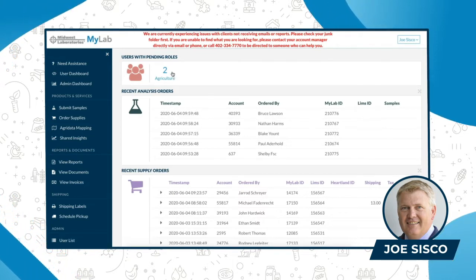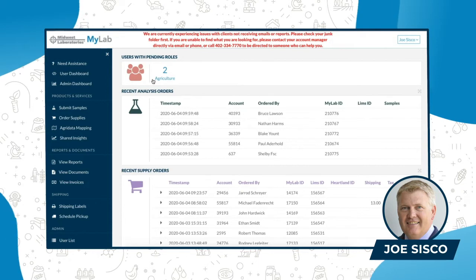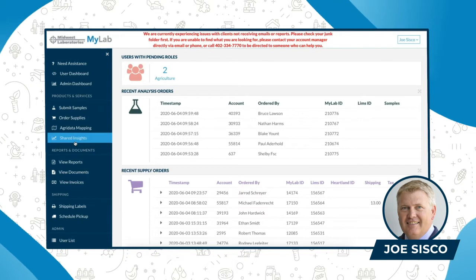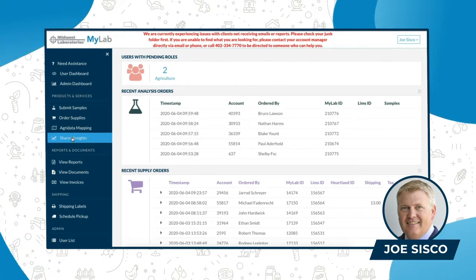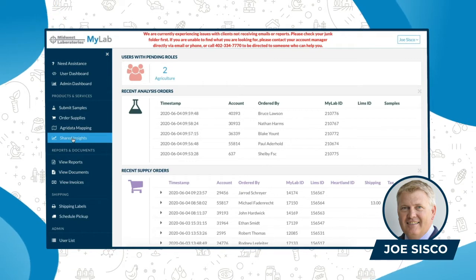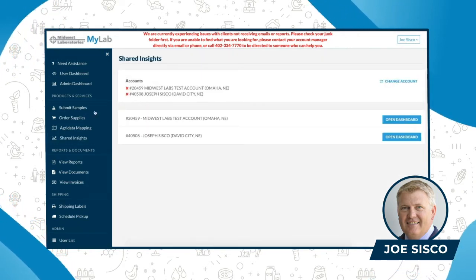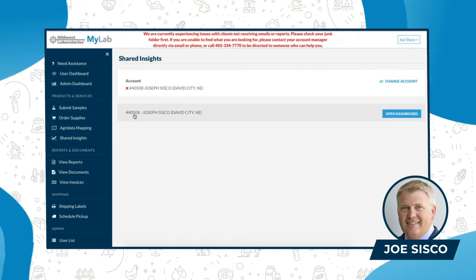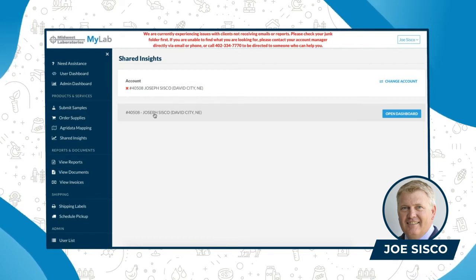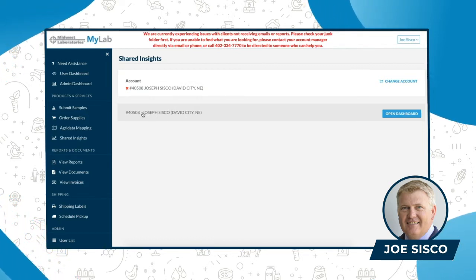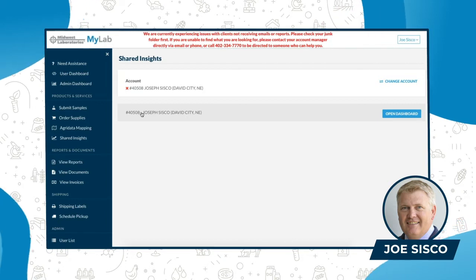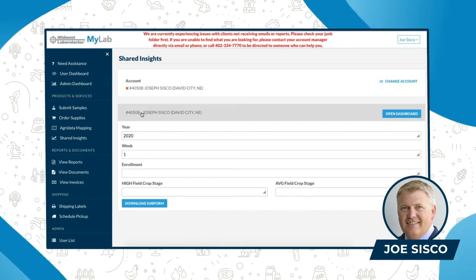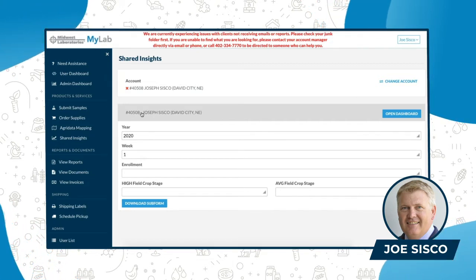First of all, you need to log into MyLab. I have the MyLab dashboard brought up here. Over on the left-hand side there's the Shared Insights tag, so you find that Shared Insights on your MyLab and you click on it to bring up your account. Your account number and account name are listed, and at this point you click on the link between your account number and your name, which brings up four areas that you need to fill in or make sure they're filled in correctly.